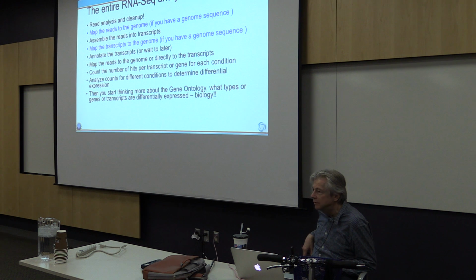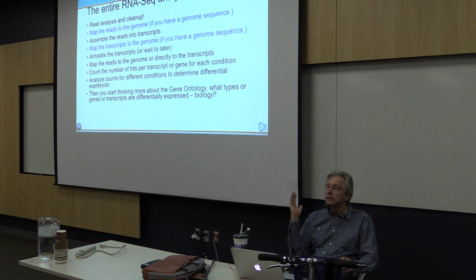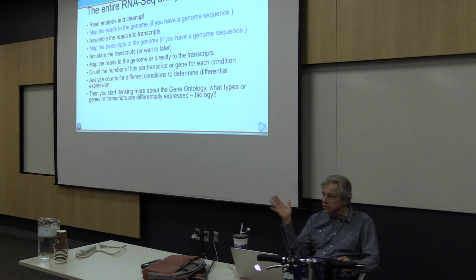Although it describes the fact that it's doing the final differential look at expression. But you begin usually with this method, or always with the tuxedo method, to map your reads to the genome.